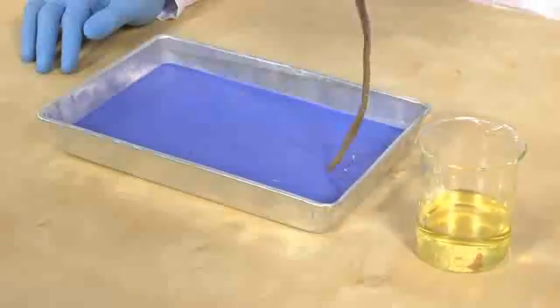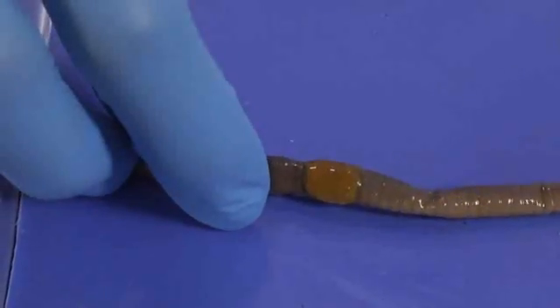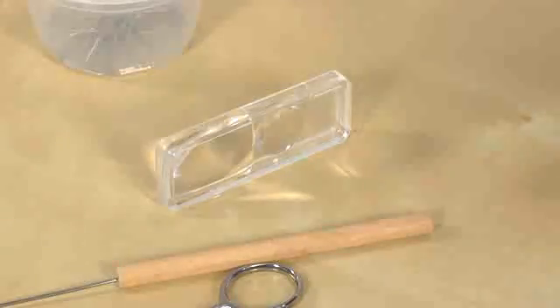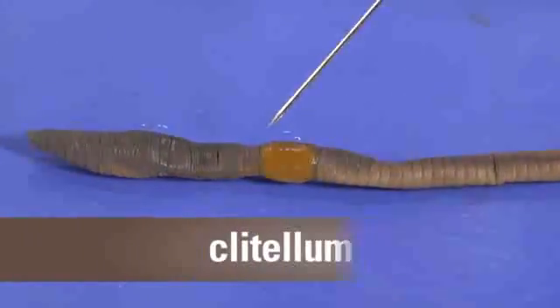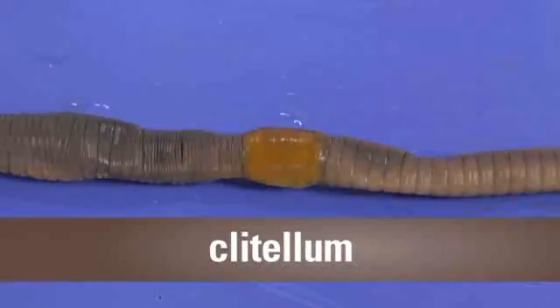First, I'm going to lay the earthworm in the dissection tray, ventral or flat side down. Now, I'll use the hand lens to find the prostomium — that's the lobe that goes over the mouth. And this swollen band here is the clitellum. The clitellum produces an egg capsule which holds fertilized eggs until they mature.